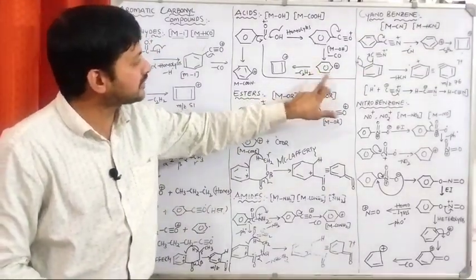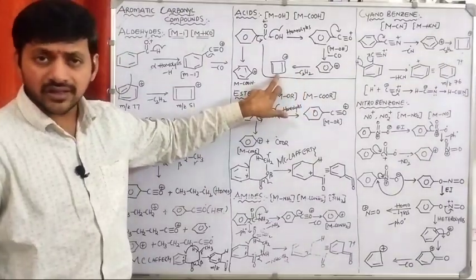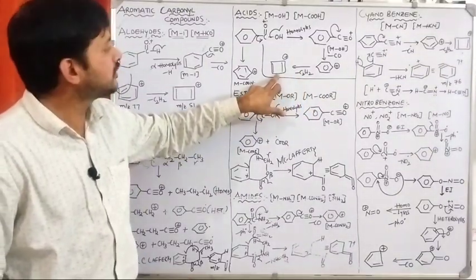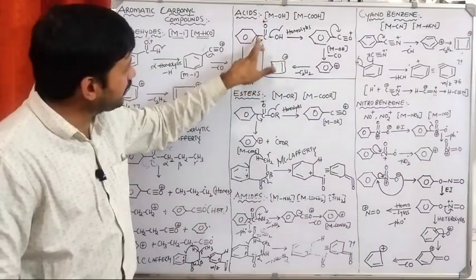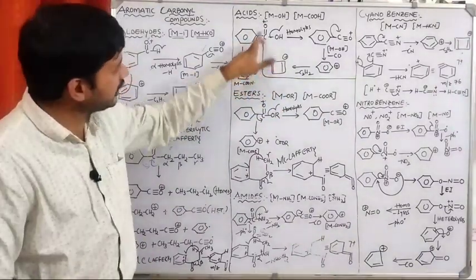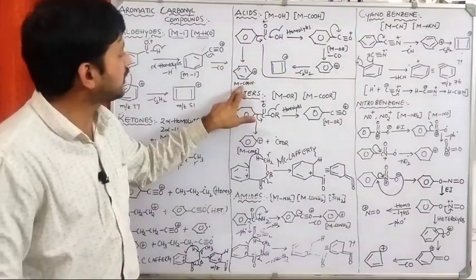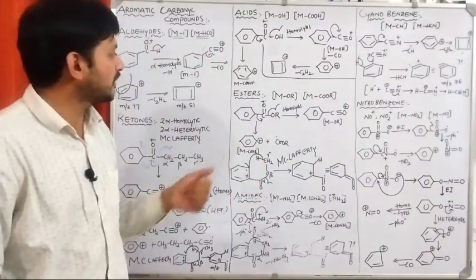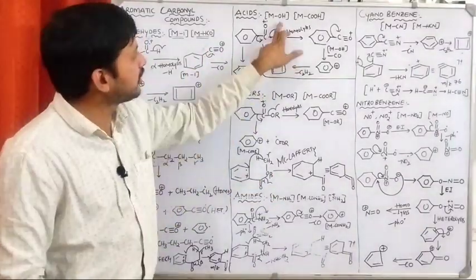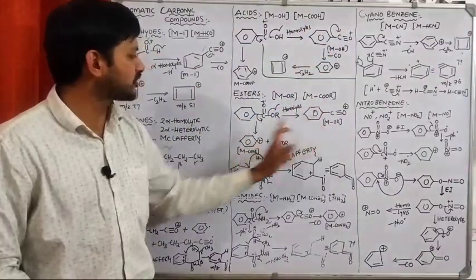The phenyl cation is further subjected to elimination of acetylene, and you will come up with this kind of 4-membered positively charged ion. Suppose we do the alpha heterolytic cleavage, what is happening? Directly COOH will be removed. Then this peak is commonly called what? M-COOH peak. In case of esters also similar. OH, COOH. OR, COOR. Same situation.